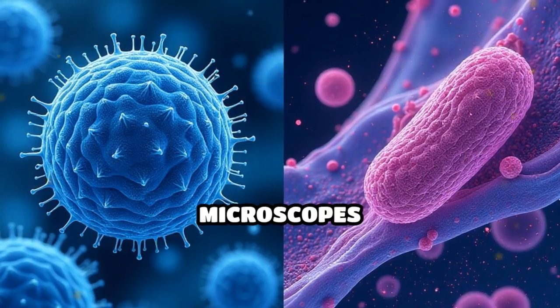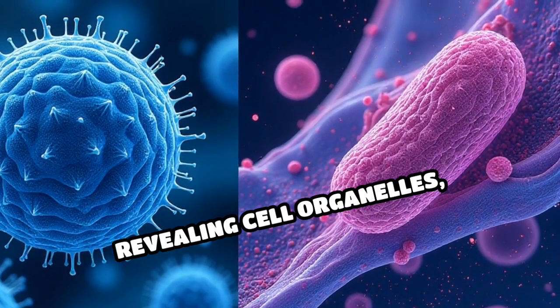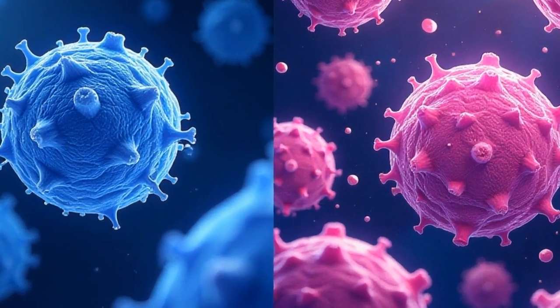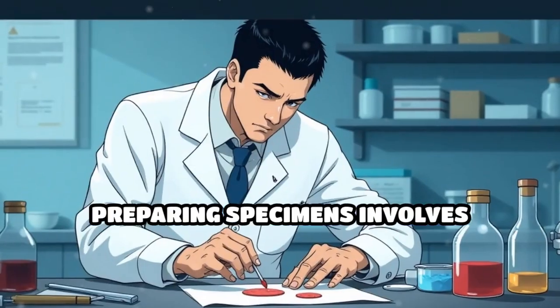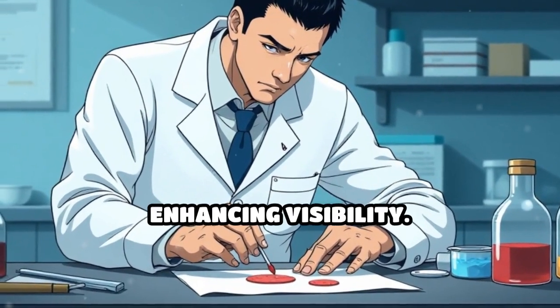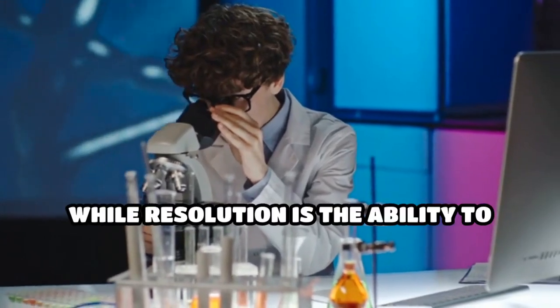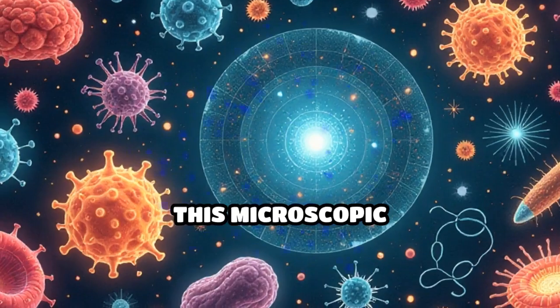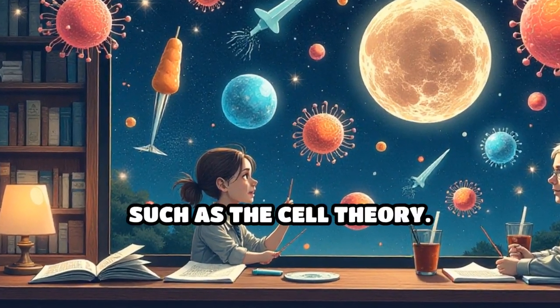Transmission electron microscopes, TEM, offer higher magnifications, revealing cell organelles, while scanning electron microscopes, SEM, provide detailed 3D images of surfaces. Preparing specimens involves fixation, sectioning, and staining, enhancing visibility. Magnification enlarges the specimen, while resolution is the ability to distinguish 2 points separately. This microscopic revolution has been crucial in scientific discoveries, such as the cell theory.